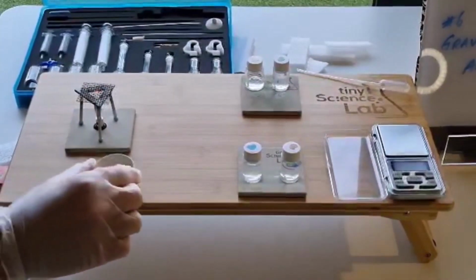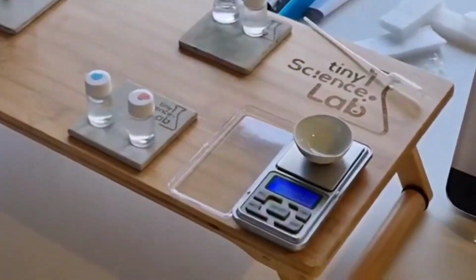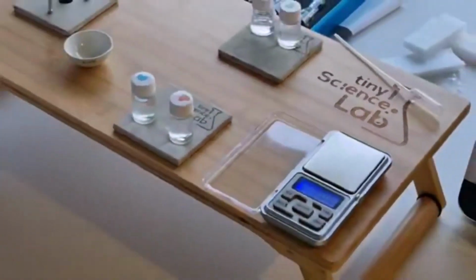So the first thing that I'm going to need to do is weigh my empty evaporating basin. So let's turn this on, let's tare it and make sure it's at 0. And then we'll pop it in. So our reading is 10.85. Let's take our first sample.